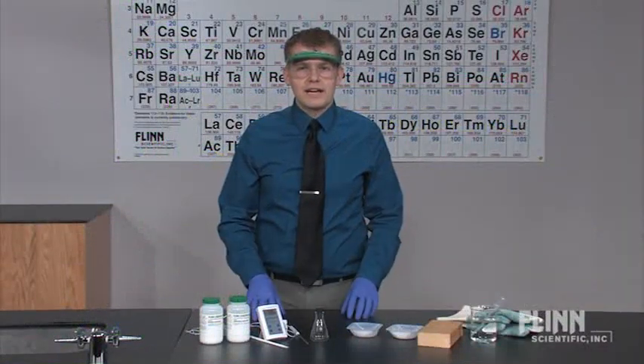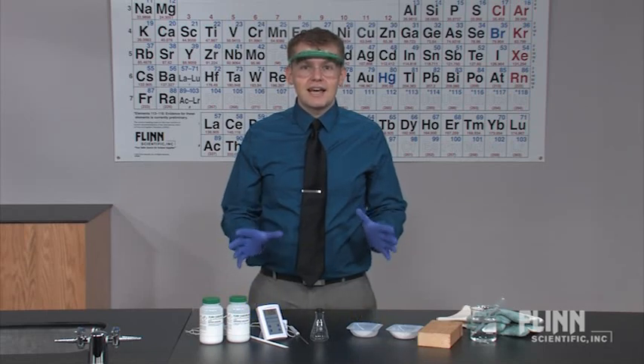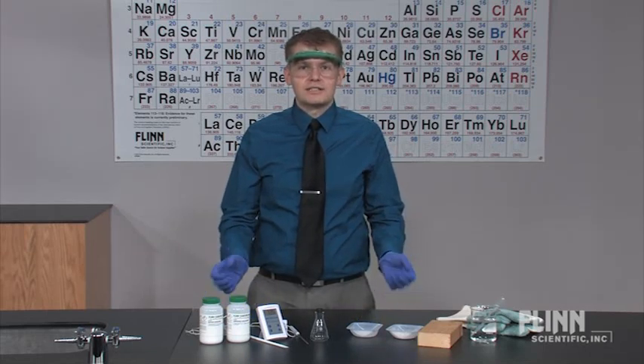When most students think of chemical reactions, they expect heat to be released. Turn this expectation on its head with the Flinn Scientific Cool Reaction Demonstration Kit.